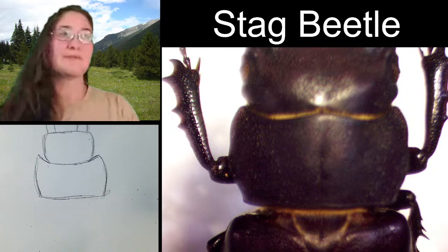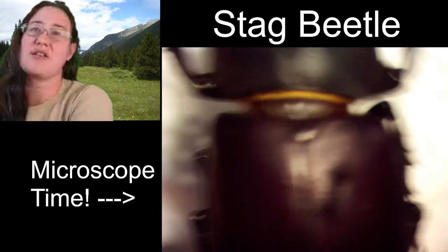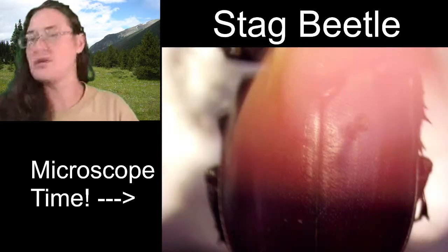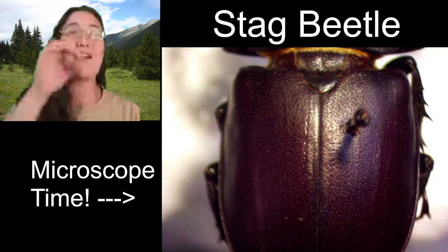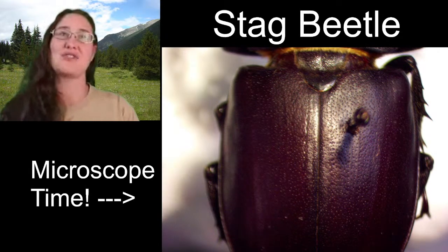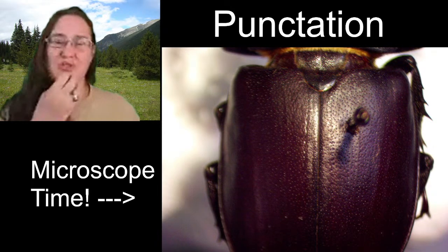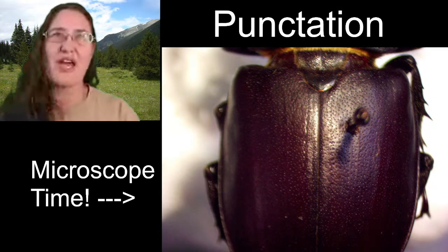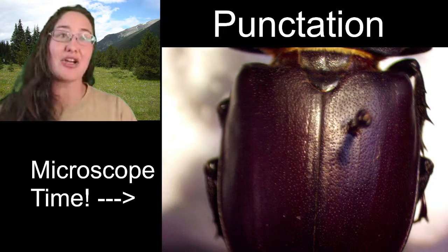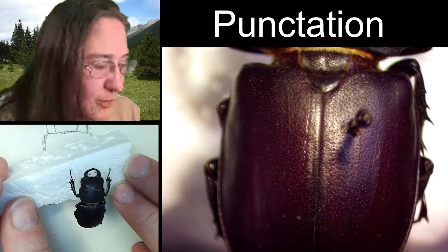Let's move the specimen. We're going to have to angle it just a little bit because this body is tilted a little bit, so it's a little tricky to get it all at the same angle. Now, if you notice all of those little dots along the outside of the elytra, those are punctations. Whenever you see in a beetle or other insects what look like little puncture wounds — like if you could take a needle and just poke the exoskeleton over and over again with little itty bitty dots — those are punctations. I don't have the ability to show the entire elytra under the microscope, but I can flip it over underneath our camera and see what we can see.